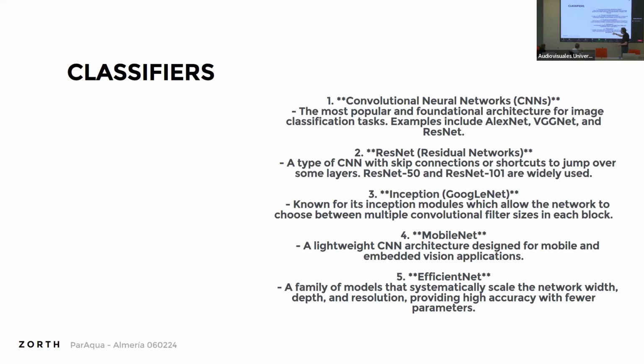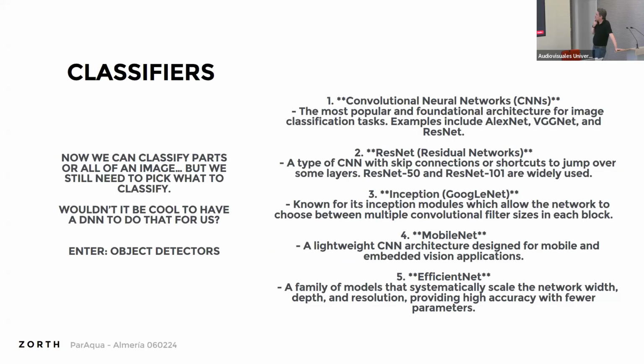EfficientNet is a difficult model to implement, but it's actually, as its name says, really efficient. It's got one huge interest, actually, which is that it can scale the network. The network will drop the weights that it doesn't need. So it can be useful if you're tight on space, but we know we never are anymore. It's a good one.